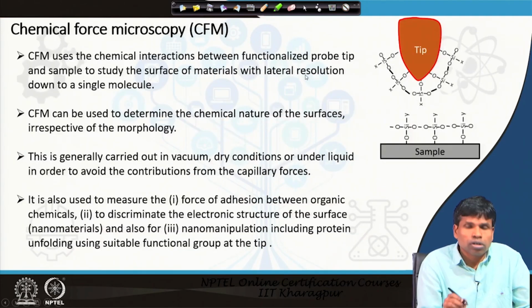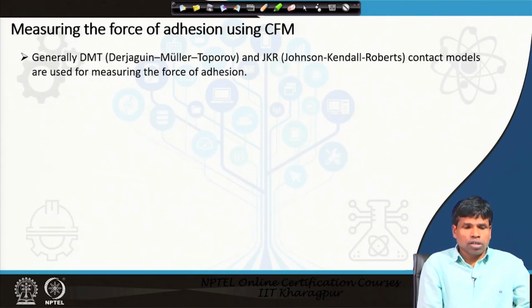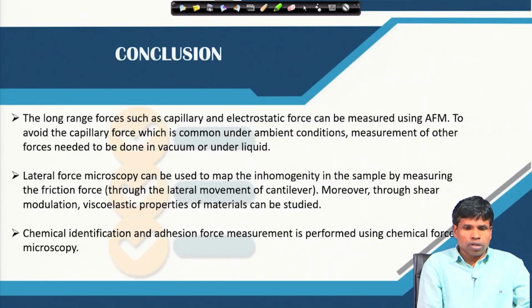We have other force microscopy that we will discuss in the next lecture. Today we go to the conclusion. We have discussed two different long range forces, capillary force and electrostatic force, and how capillary and electrostatic force can also be measured using atomic force microscope.